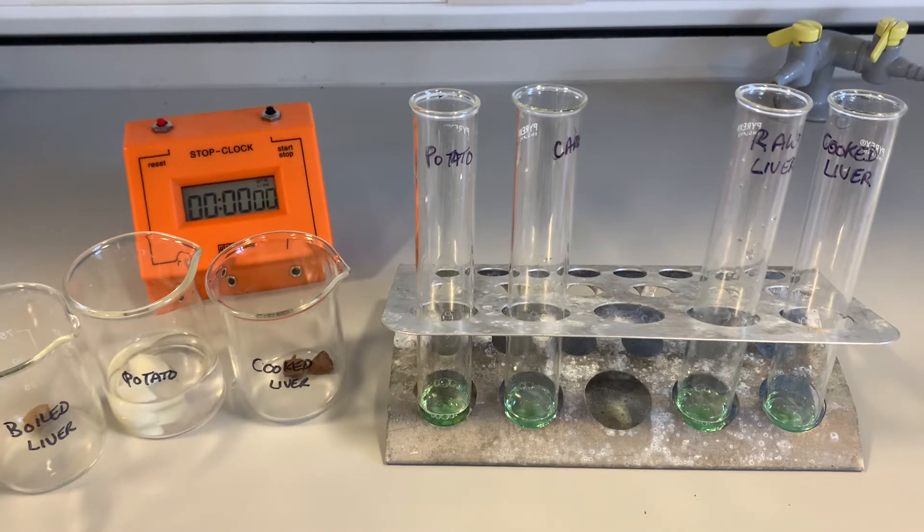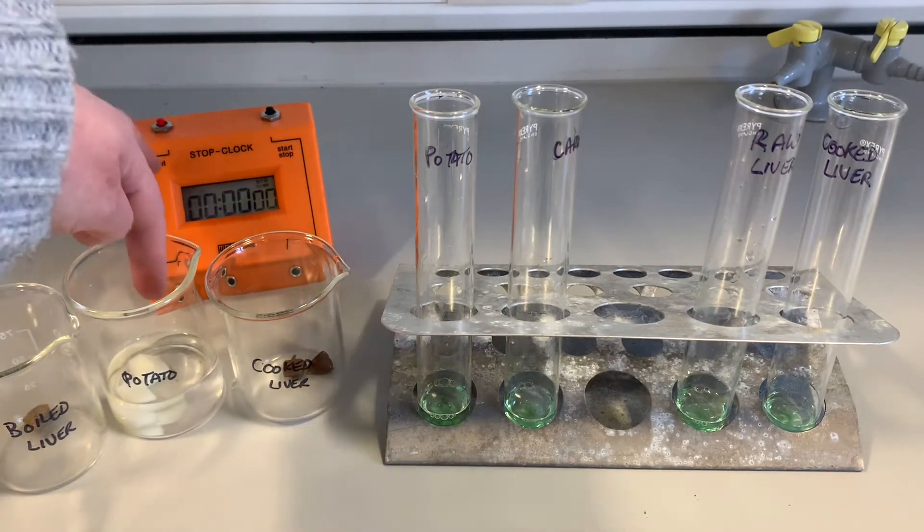In this experiment we are going to use a range of living and one dead tissue to find out its effect on the hydrogen peroxide. In my test tubes I have got equal volumes of hydrogen peroxide and equal volumes of detergent. To one of my test tubes I'm going to add some potato.